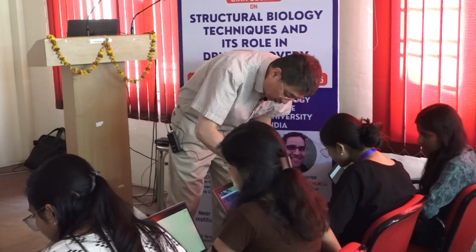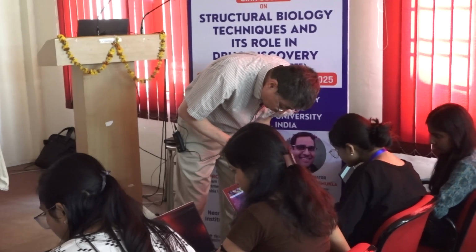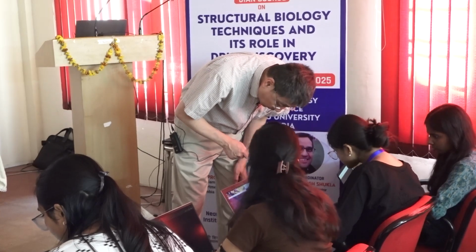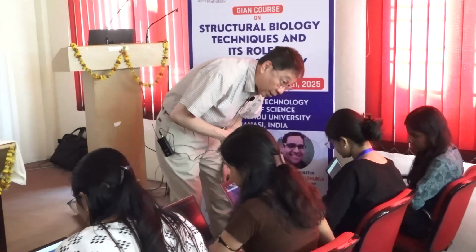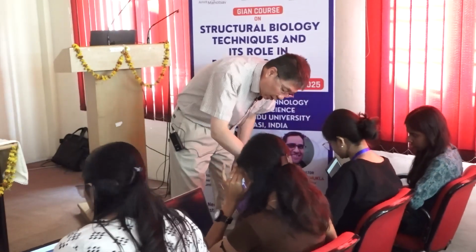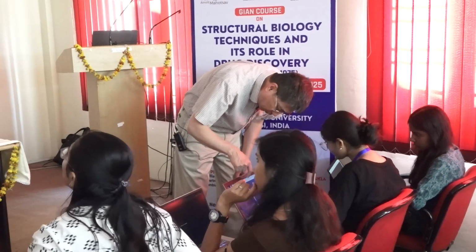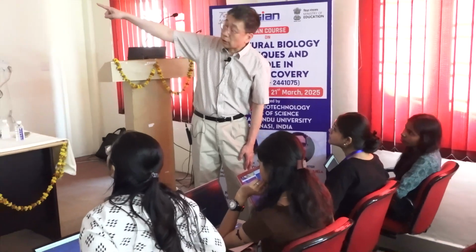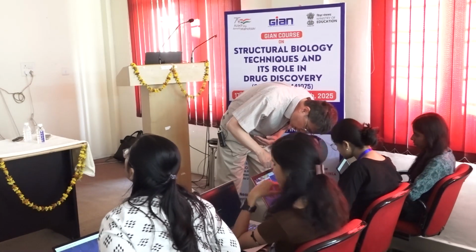See, now you're in residue 2 now, right? Which residue is that? This one is the arginine. Which residue number? I can't see. This is 45. Arginine. Okay, 45. That's not it. Okay, so why don't you do that? Why don't you go to the arrow up here, the toolbar, this thing, the green one.